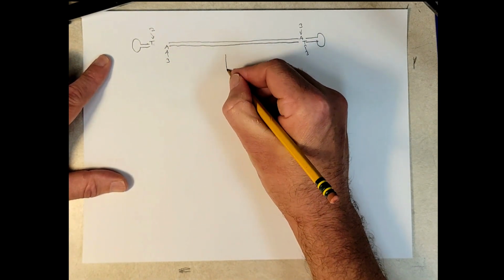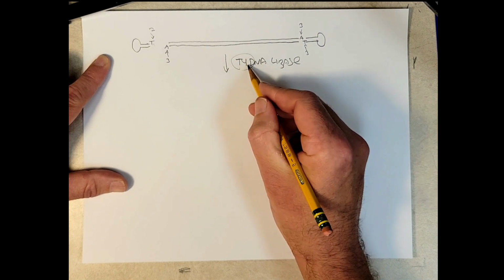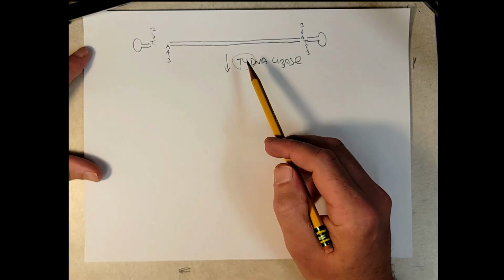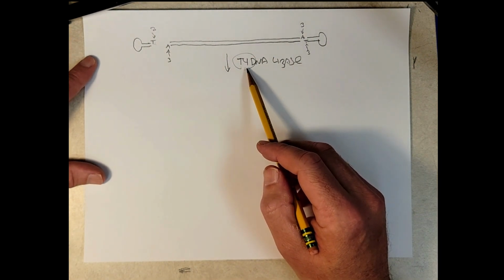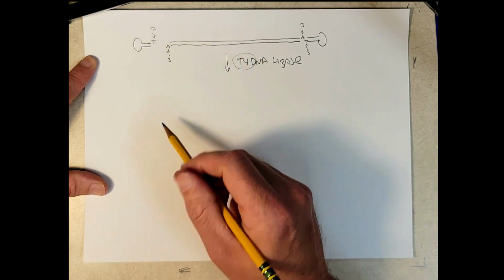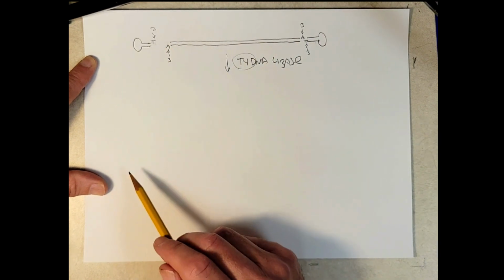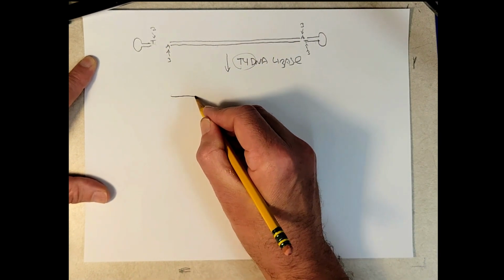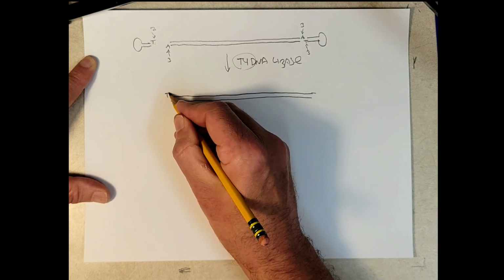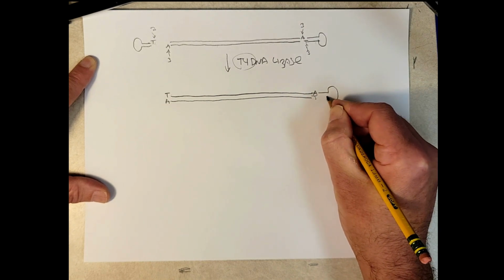And so what we're going to do is add DNA ligase. So T4 DNA ligase. And T4 is coming up a lot. This is a bacteriophage, and one of my goals this semester is for one of those to-be-determined classes to cover the T4 bacteriophage. But we'll talk more about that later. So we're going to add T4 DNA ligase with the adapters and our DNA molecules, and it's going to ligate the adapters to the ends of our molecules. So we should end up with all of our molecules that we want to sequence looking like this.